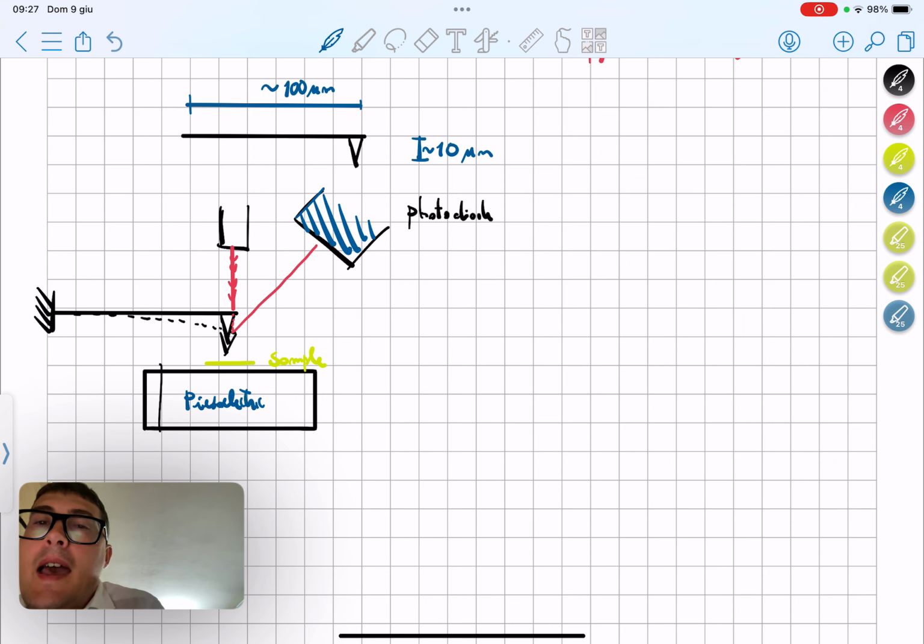According to the curvature, the bending of the cantilever, we can determine if there has been a lateral displacement, because the tip itself is made of atoms, and these atoms will interact with the atoms of the sample surface. But this is not a flat surface; there is some topography. Therefore, we might have lateral forces as well as vertical forces.